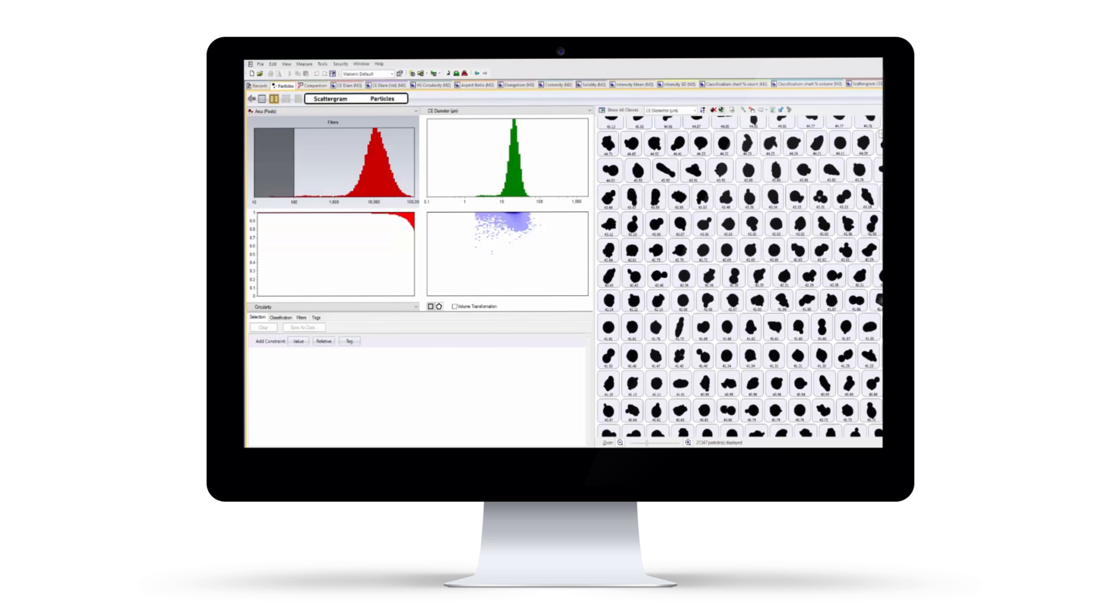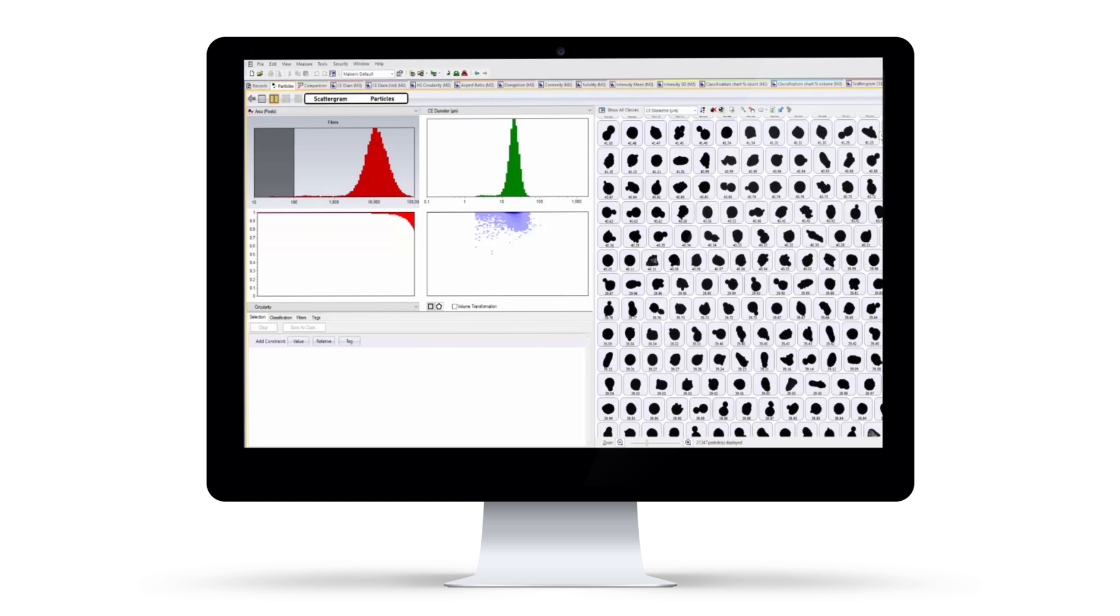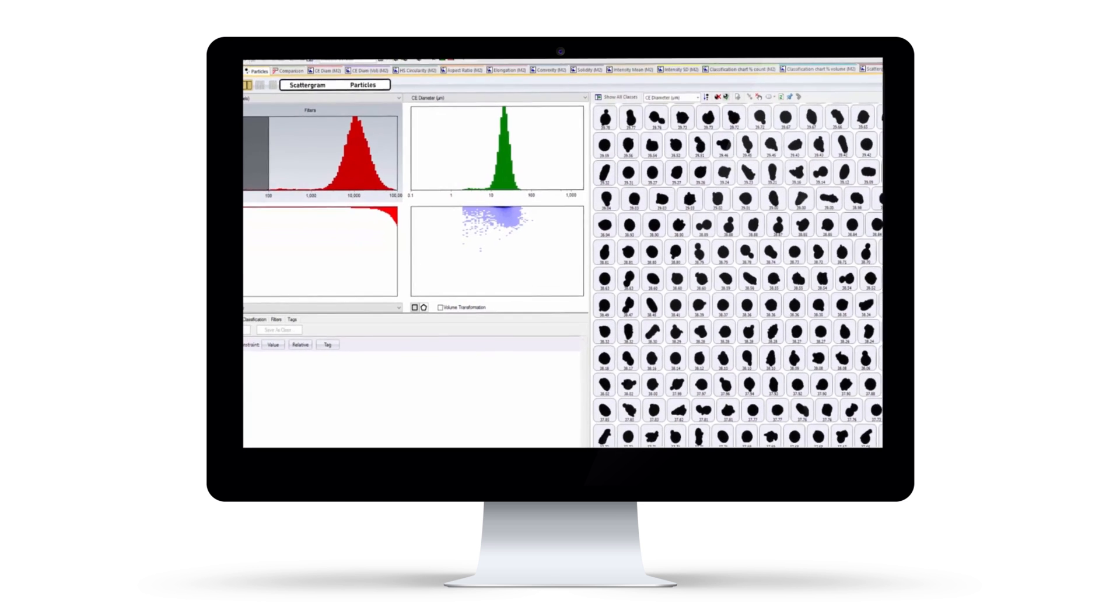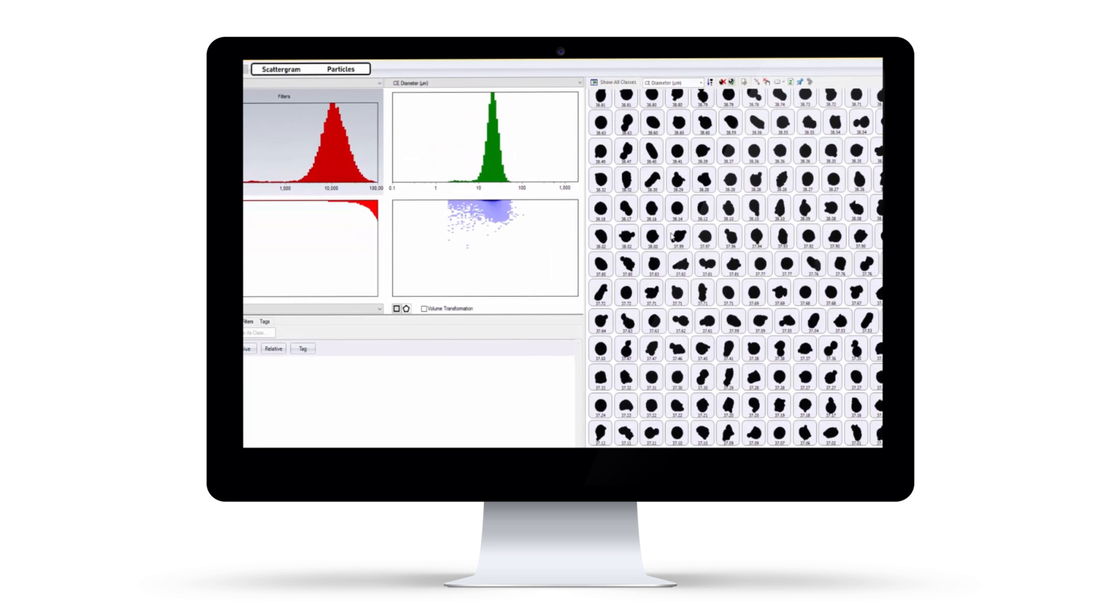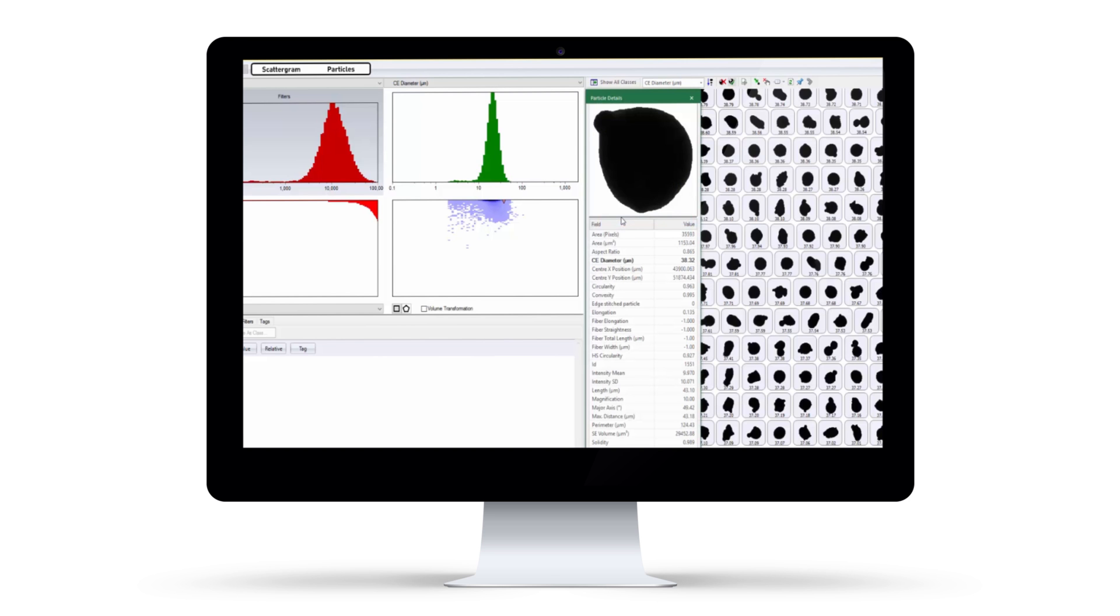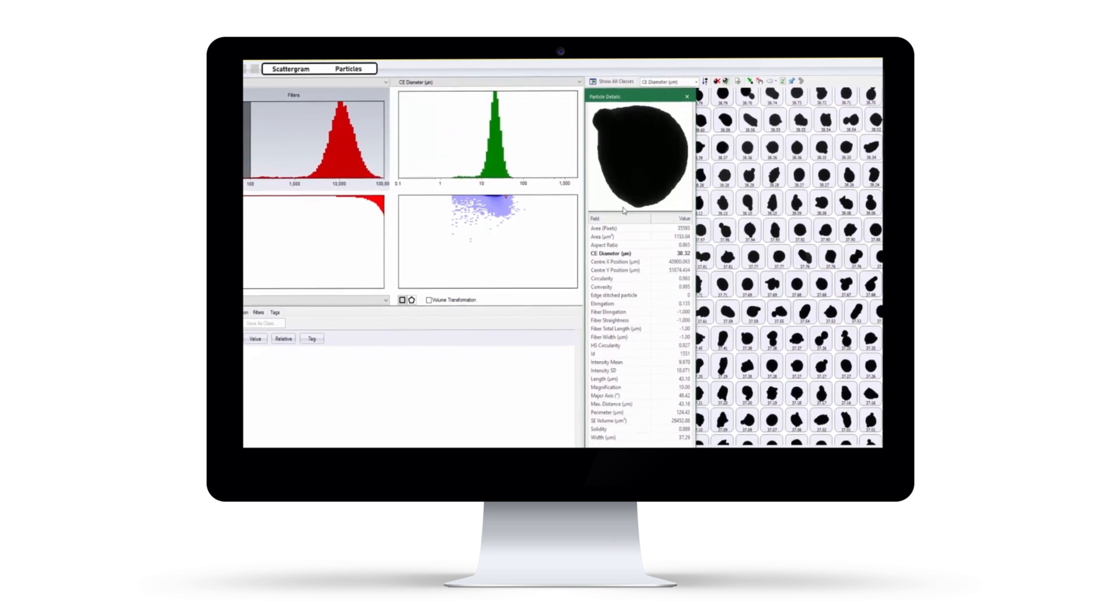Each particle can then be classified based on its morphological properties, enabling a deeper understanding of your sample's characteristics and final product performance.